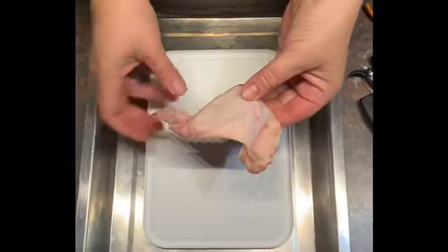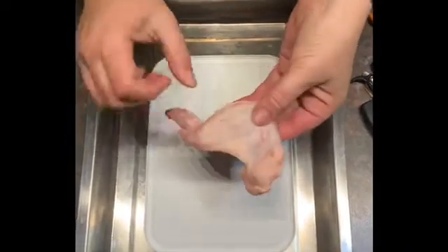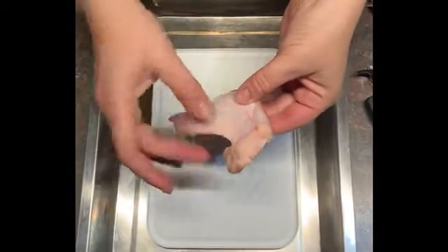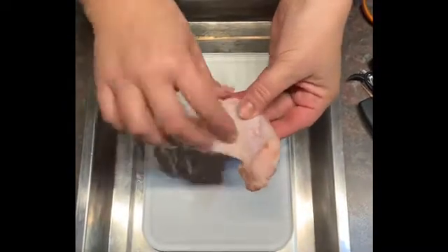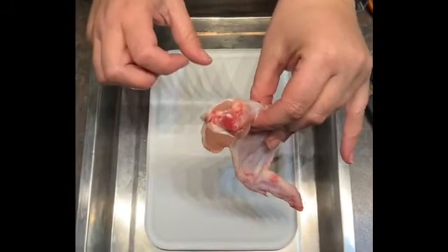Here we have a chicken wing that you can see is obviously raw. It's had its feathers removed, although there are still one or two feathers in the skin over there. This is its wing tip, and this is the area where it would be connected to the rest of the body.